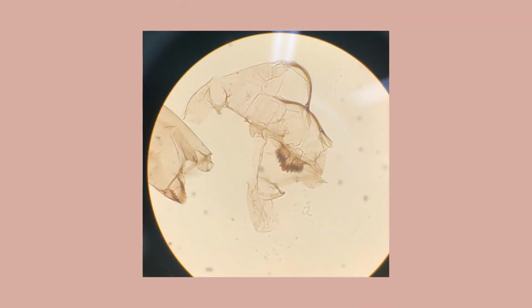Hi, my name is Regan Steigleder and I'm currently a senior at Northwestern and I'm working on my senior thesis with Professor Yarrow Axford. My research involves identifying insect species in sediment cores, and these are called chironomids or midges, and based on their species you can tell a little bit about historic temperatures. And our sediment cores are from Greenland, so I'm working on a time period called the Younger Dryas, and I'm currently in our microscope room and I will show you around a little bit.